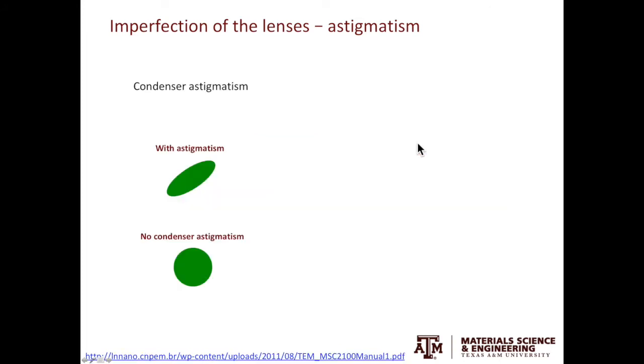In TEM, we mainly deal with two types of astigmatism. The first type is called the condenser astigmatism. When you converge the beam, and if the probe shape is elliptical, then the beam has condenser astigmatism. In contrast, if the beam is circular in shape, then there's no condenser astigmatism.